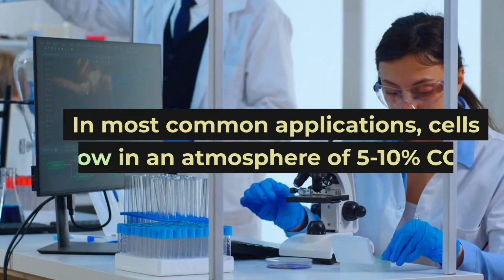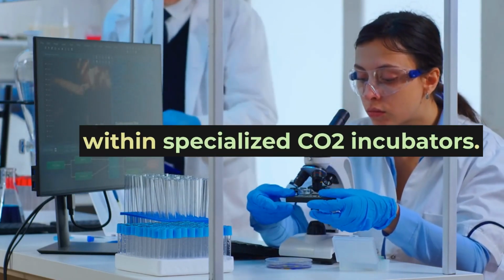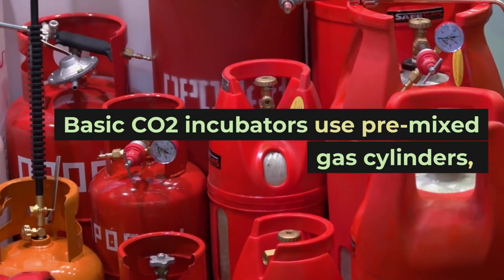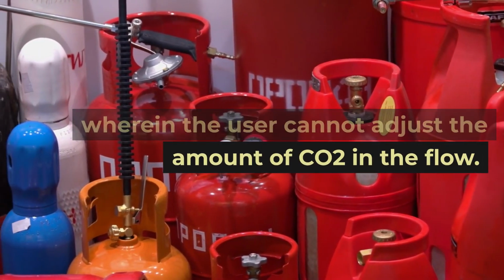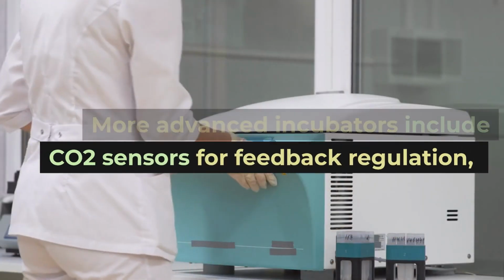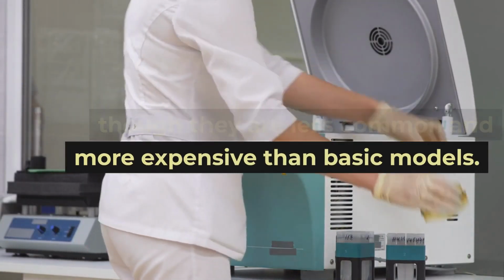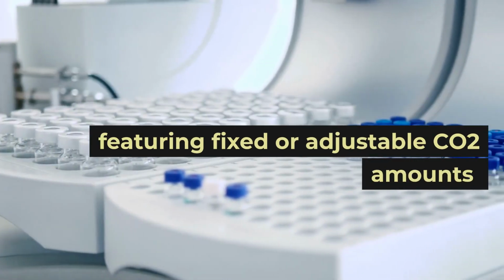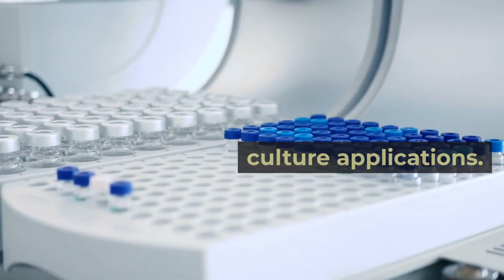In most common applications, cells grow in an atmosphere of 5 to 10% CO2 within specialized CO2 incubators. Basic CO2 incubators use pre-mixed gas cylinders, wherein the user cannot adjust the amount of CO2 in the flow. More advanced incubators include CO2 sensors for feedback regulation, though they are less common, and more expensive than basic models. Working with static gas mixtures featuring fixed or adjustable CO2 amounts now forms the foundation of cell culture applications.